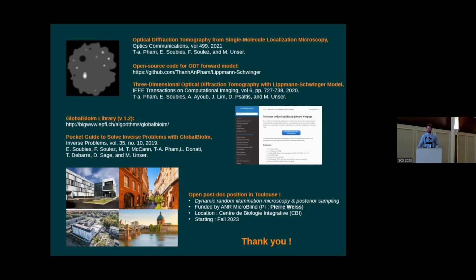Thank you. Very interesting talk. As far as I understood, you have to activate the molecules one at a time, right? Could you activate them by group, or is it a problem, or would you need to assume that they emit incoherent light to do so?